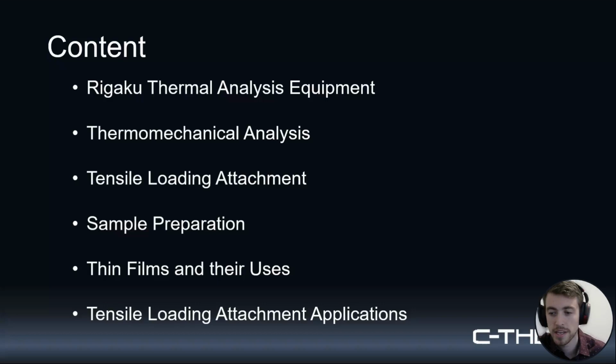Then we're going to take a step back and explain what thin films are and kind of how they're used. And lastly, I'm going to go over some results, or you could say applications of the tensile loading attachment for thin films.